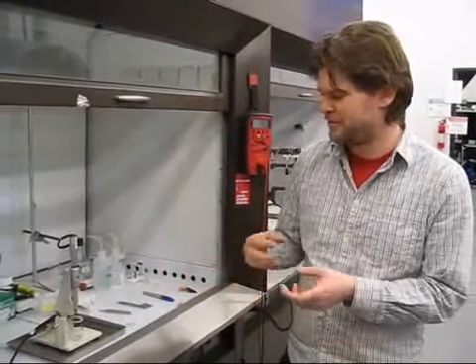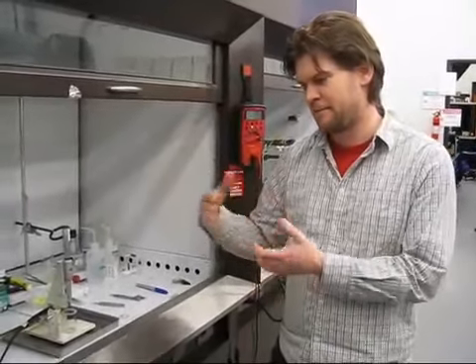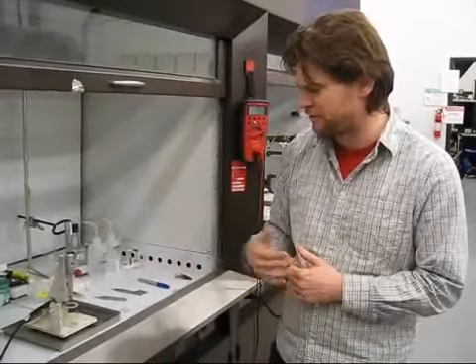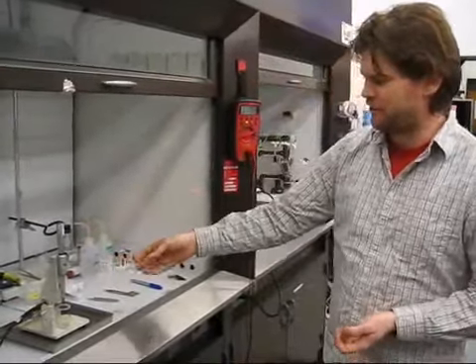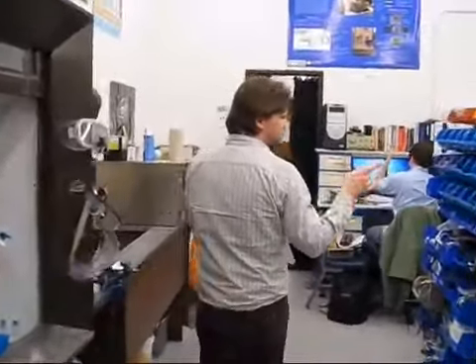There are different reasons you choose different materials, but usually it has to do with field enhancement, the type of sample you're using, and what reacts best with the metal for the field enhancements that you want. So we have different etch parameters and different chemicals for different materials. Once we've etched them, we'll do a quick analysis on a scanning electron microscope just to verify that we're getting good parameters.